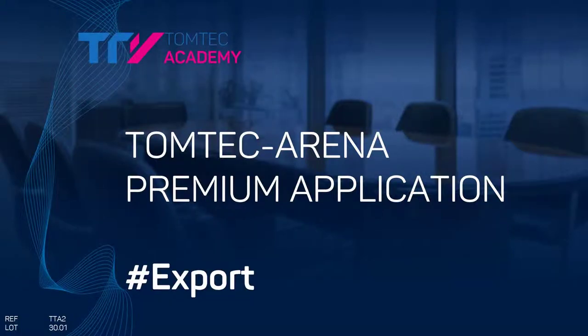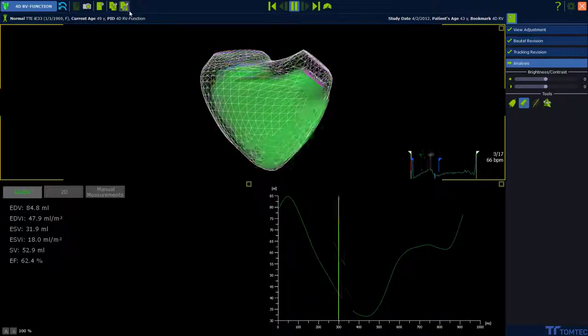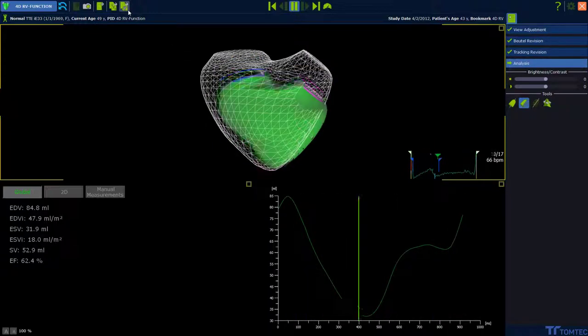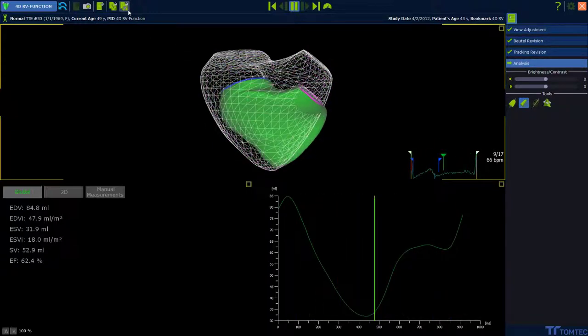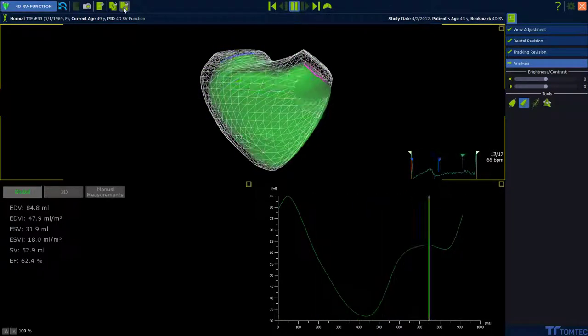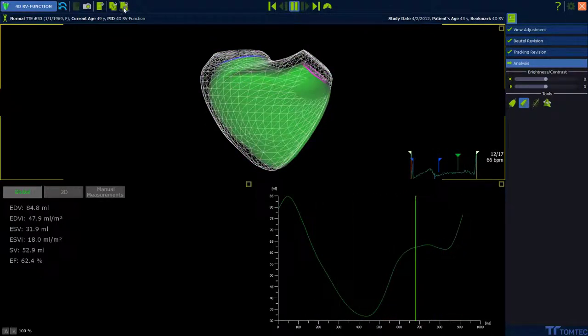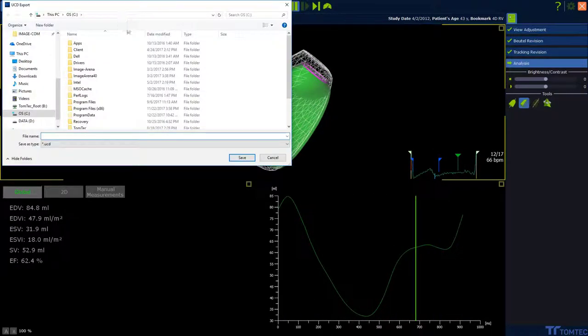How to export data and information from TomTech's premium applications? For all TomTech premium applications, we can export data on the top. The first button means we can export an unstructured cell data report, including geometrical information.